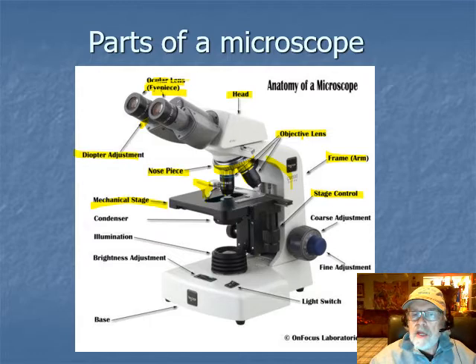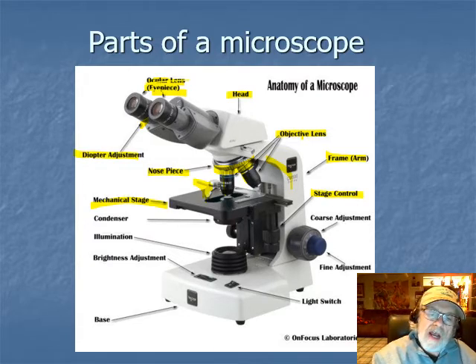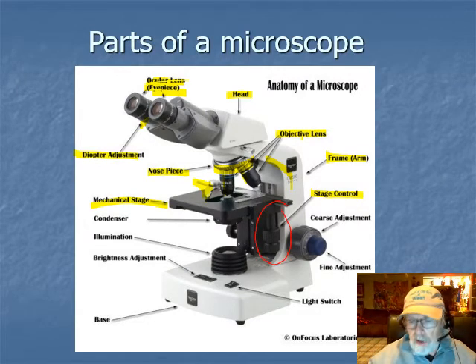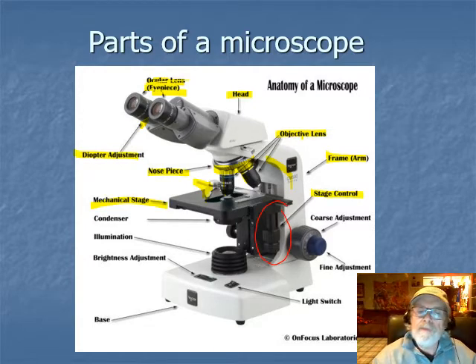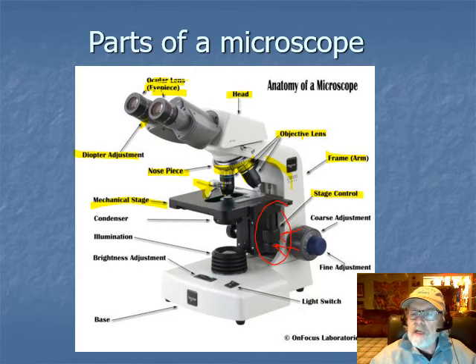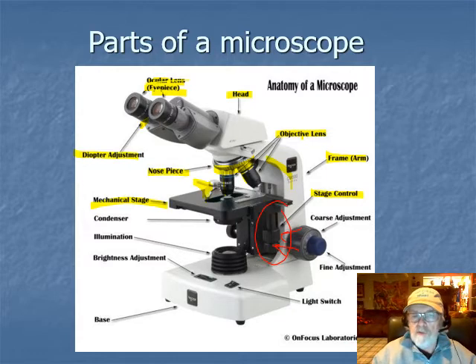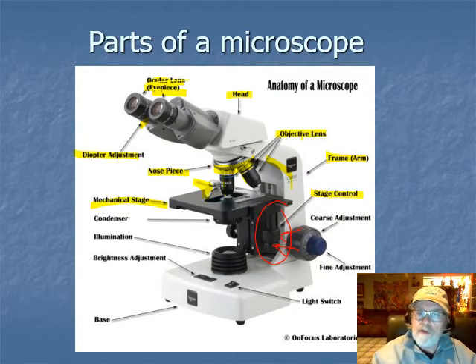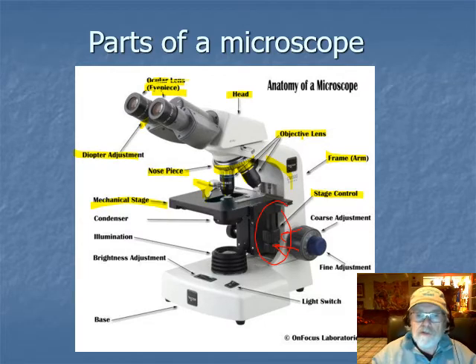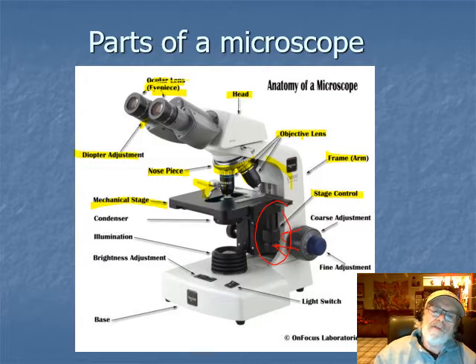The next thing is the stage control. On the side of the stage there's a rod with two little screws. Depending on which one you move, it will move the stage in an XY arrangement - one moves it horizontally, one moves it anterior-posteriorly. That way you don't have to move the slide around by hand; you just use the stage control. When the stage moves, you'll see the slide move underneath your field of vision through the oculars.